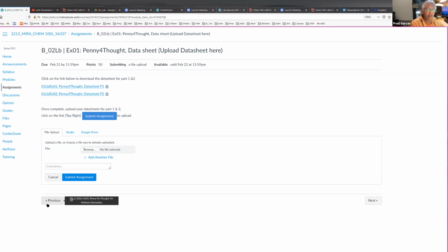If you go into more advanced courses, when you're keeping a lab notebook, maybe that initial entry was the correct one. When you scratch it out so you can't see it again, you've wasted time. By just drawing a simple line, you can ignore it, but it's still there if you want to see it. And then write the new entry.